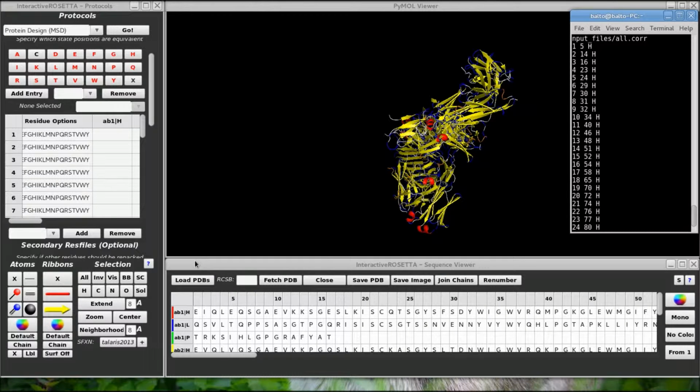It is not necessary that the first position be 5 on all the chains. I could have set the first antibody to have residue 5, the second one have residue 10, and so on. It just happens to be the case that in this protein design the structures were such that it made sense to have the same residue position at every abstract location. Man, this is going to take a long time to fill up this palette.